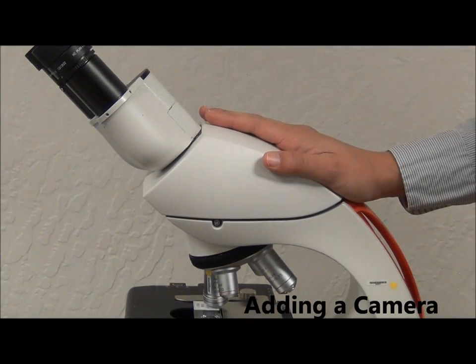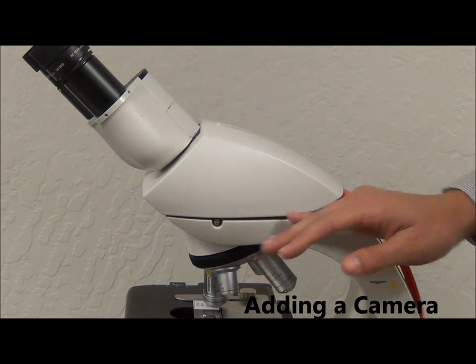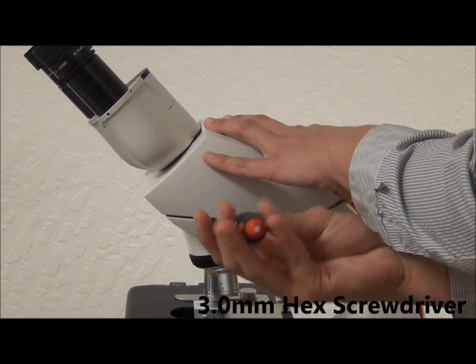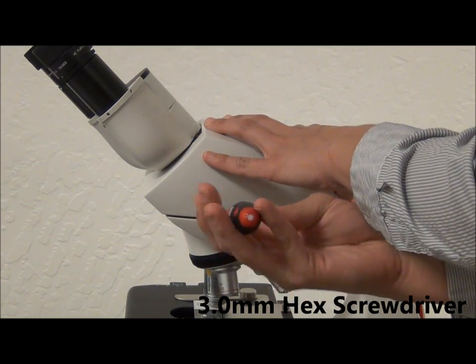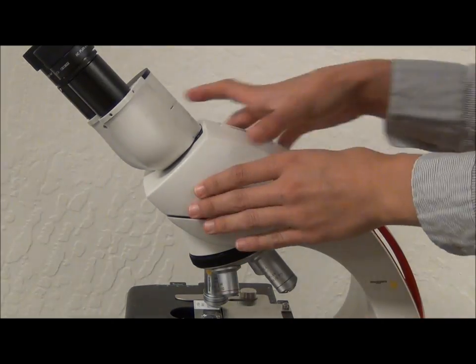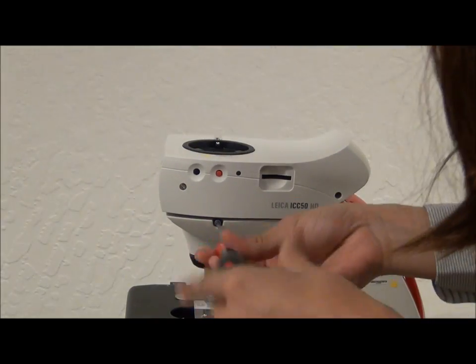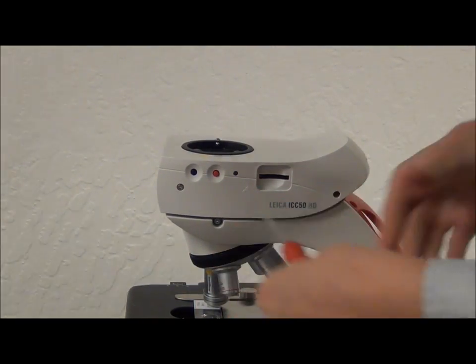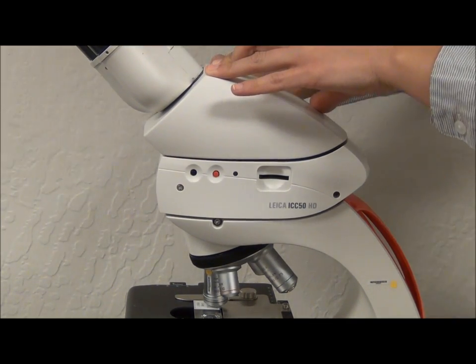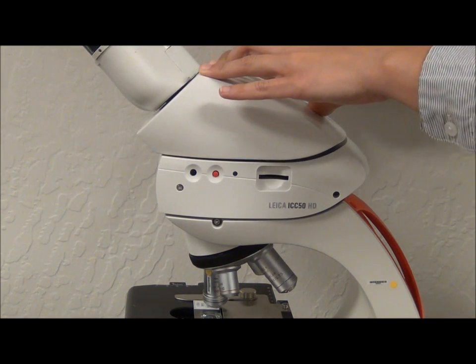This is the student version of the microscope, but we can easily add a camera in between the binocular head and the microscope body for imaging. First, we unscrew the binocular head, and then we put the camera in between the binocular head and the microscope body. In order to be able to rotate the binocular head, you have to keep the screws slightly loose.